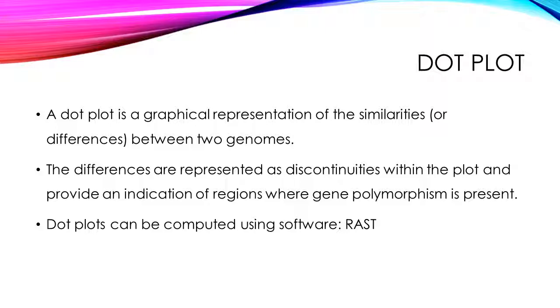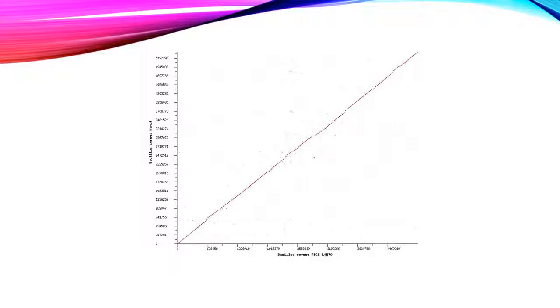A dot plot is a graphical representation of the similarities or differences between two genomes. These differences are represented as discontinuities within the plot, making dot plots useful for identifying regions of the genome which are discontinuous. In this example, the dot plot is developed using Bacillus cereus as a reference — specifically the Bacillus cereus ATCC strain. As you can see, there are certain discontinuities in the plot which indicate differences in the genome, and by zooming in on these, one can identify specific regions which have evolved or mutated.